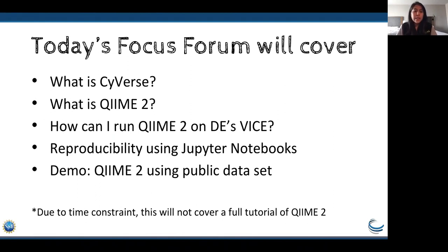So I'll go ahead and demo at the end of this how you'll be able to log into the Discovery Environment and be able to check out some Jupyter Notebooks I've created, and then we'll go over a short demo. I want to also highlight that due to time constraint, I'm not going to cover a full tutorial of QIIME 2. If that's a very big interest with participants, I can do something along those lines as a YouTube video at a later time.